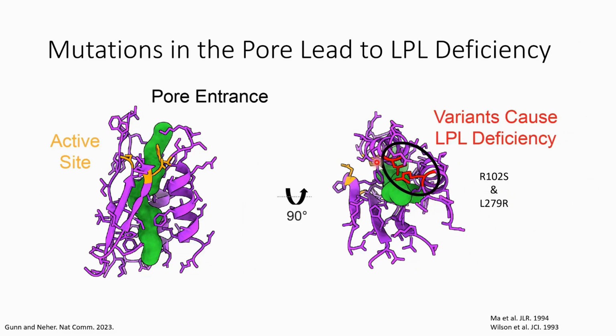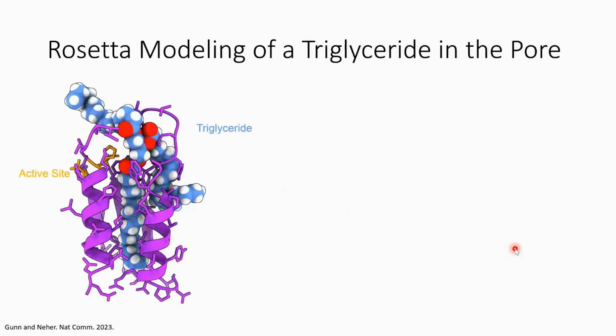but that there is something inhibiting the hydrolysis of long chain substrates. And perhaps it could be their release from this channel. So this is definitely an area that we're interested in studying more.